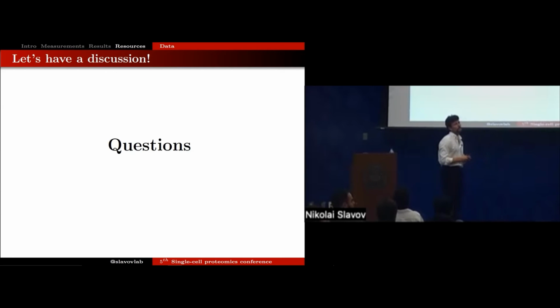Stella asks from the Zoom, are those samples referring to the plexDIA figures from in vitro cultures or extracted from cancer tissue? In the latter case, how well do you think the single cell separation and identification can be? So the raw data that they showed came from in vitro cultured cells, but we have analyzed primary cells from human tissues. In fact, Andrew might show some of that data. And the data don't look very different.